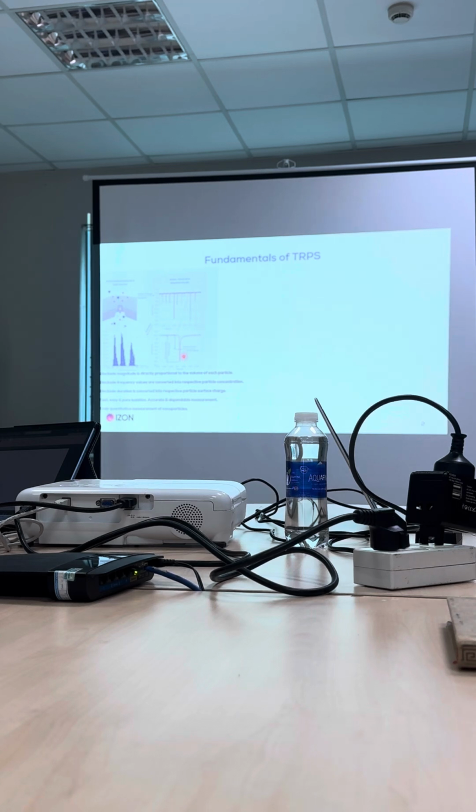particles. Zeta potential is a very important characteristic because it assesses the stability of the EVs in the solution. Later, if you're making an EV drug, and the zeta potential is very low, it means it's not stable in the solution. For example, it aggregates in maybe just 1 day, 2 days. That is not what the customer wants.